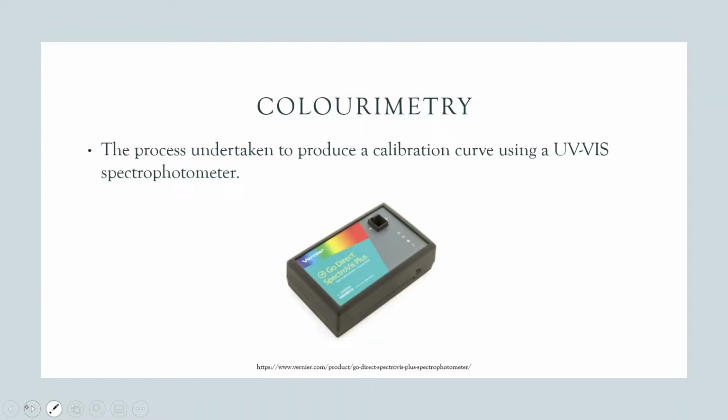Let's get into it. So to do this, we are following a process called colorimetry. Generally, you can undertake colorimetry using a UV-Vis spectrophotometer. School ones usually look something like that. Again, all the interworkings are on the inside. You'll notice that there's a little hole here for a container for the sample, but that's about all you get to see from the outside. Similar processes can be done to undertake colorimetry for AAS spectrometers, but they're significantly larger and much more expensive, so we won't be doing that in the school lab.